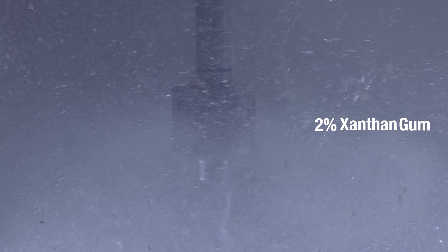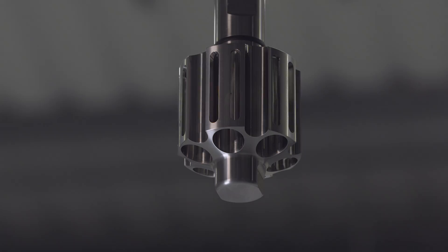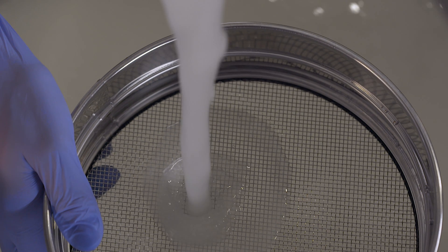With a Silverson mixer, you can add the xanthan gum quickly, and the high shear action of the mixer will rapidly disperse it, giving a uniform, agglomerate-free mix. The Silverson Ultramix is ideal for this application. It's designed for higher viscosity mixes and will rapidly disperse and hydrate the gum, providing an agglomerate-free dispersion time after time.